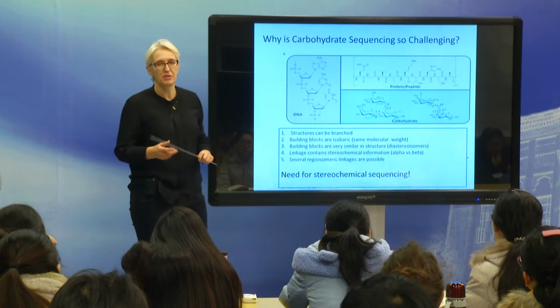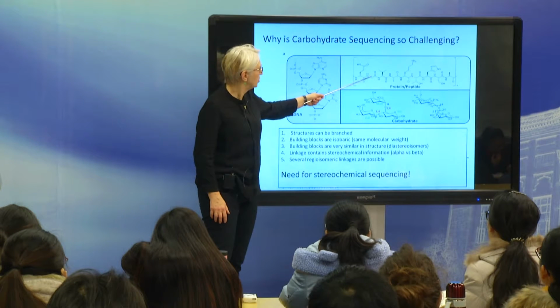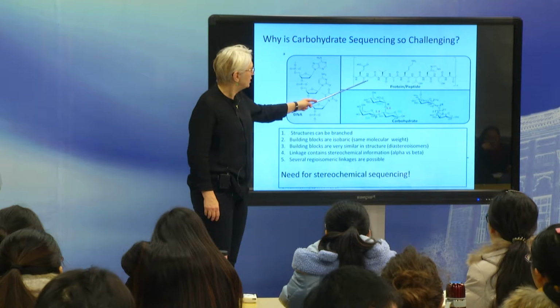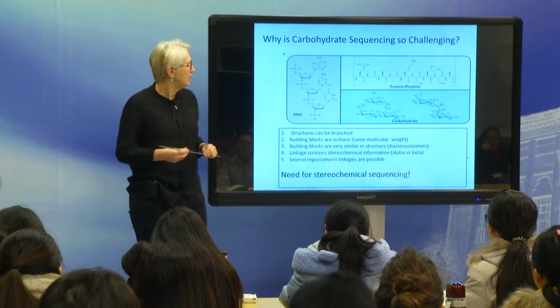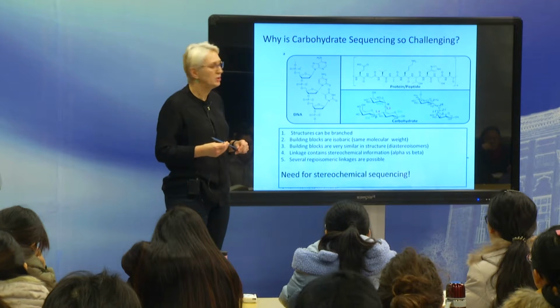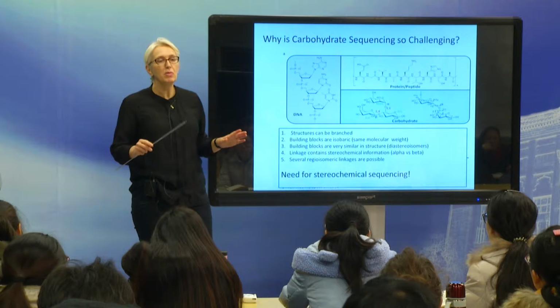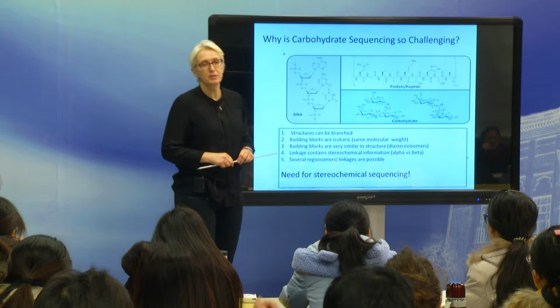Very dedicated methods. You can't even apply them to proteins or carbohydrates because you've got far more building blocks and far more complexity. With proteins, you've got 20 building blocks. You don't have a polymerase or anything like that. So the Sanger sequencing type, which I introduced to you, doesn't work. So what do people use for protein sequencing? Well, there are lots of methods available. I can't go through them, but one method, which is nowadays mostly used for protein sequencing, is mass spectrometry.